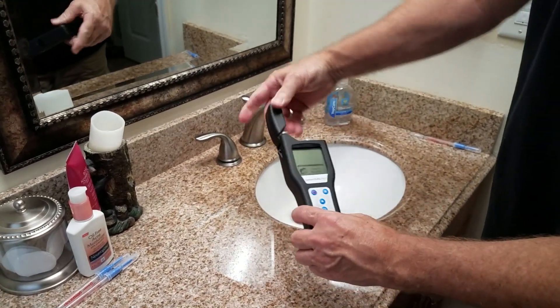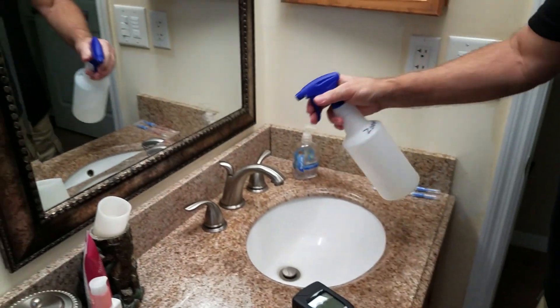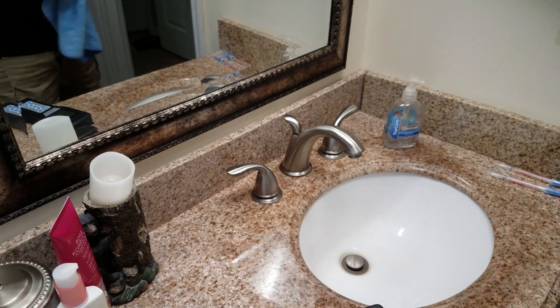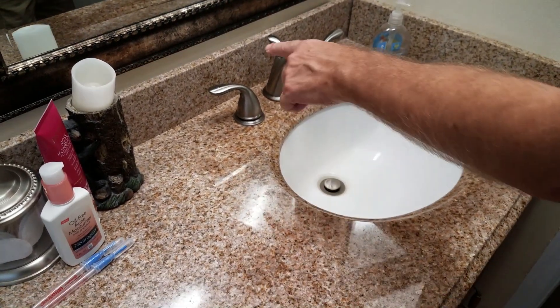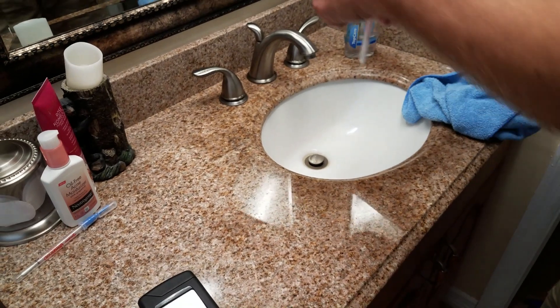Now what I'll do is put our other product on here. We'll let that dry and test it. We used this product, which is called Zuno, over here.